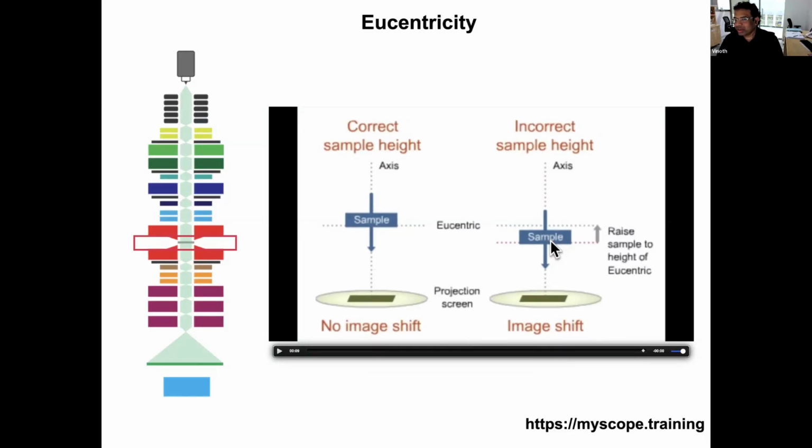It will stop in the middle of the night. And the next day when you come, you will find that you have only 50 or 100 images, and then you will be cursing yourself. That's one thing that can happen. The next thing is, because of the difference in heights, the particles in the images may have different magnification, and many other distortions will happen.